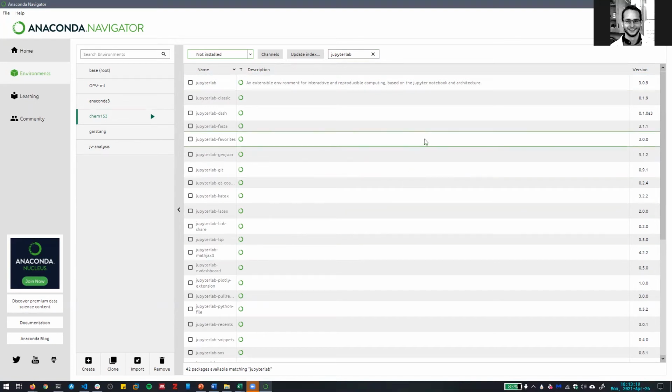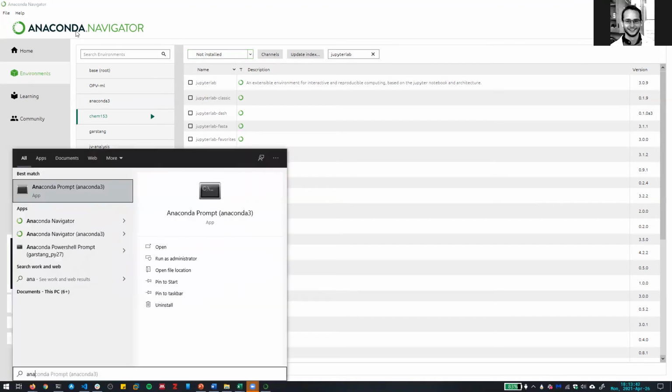So let's do another check-in. How many people have the installer downloaded already? The thumbs up. I have the installer downloaded. It's just installing now. Okay, good. It looks like we're making some progress. So yeah, once you've run that installer, then you want to open up this Anaconda Navigator program, which on Windows, if you type Anaconda Navigator, it should show up in your apps, assuming that everything installed correctly.